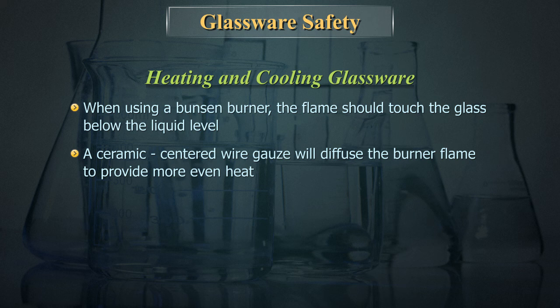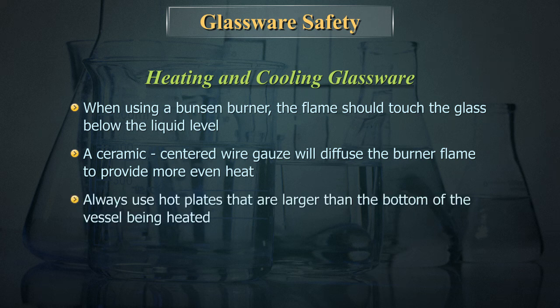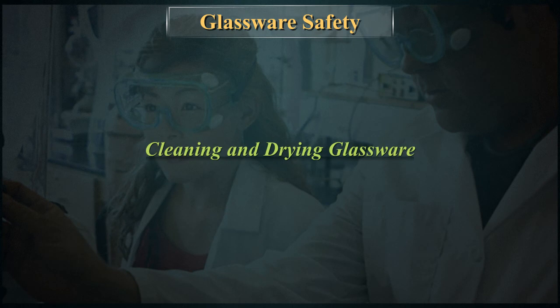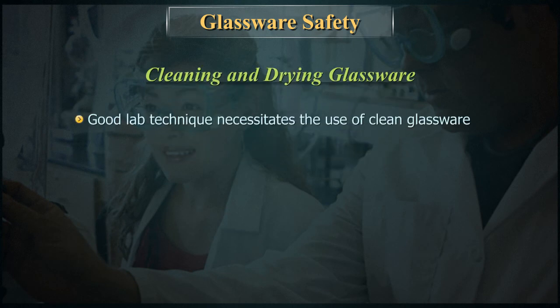A ceramic-centred wire gauze will diffuse the burner flame to provide more even heat. Always use hot plates that are larger than the bottom of the vessel being heated. Thick-walled glassware — for example, jars, bottles, cylinders, and filter flasks — should never be heated on hot plates.